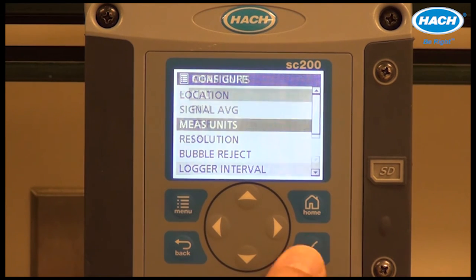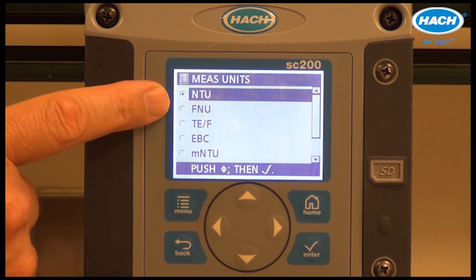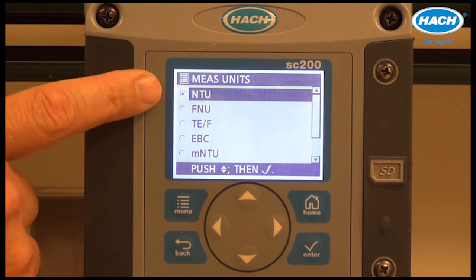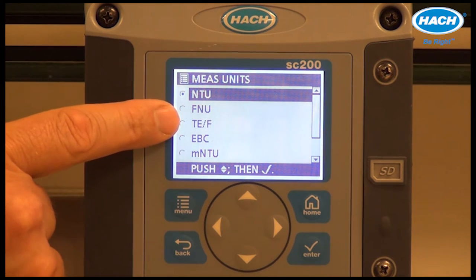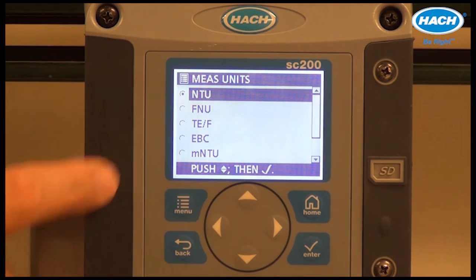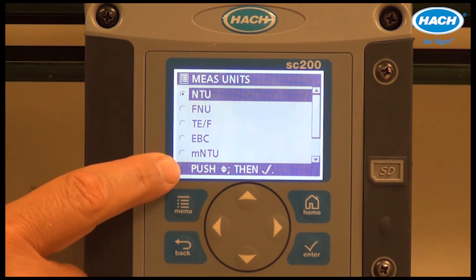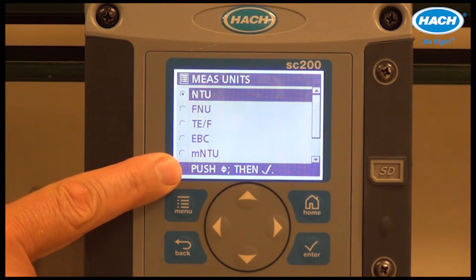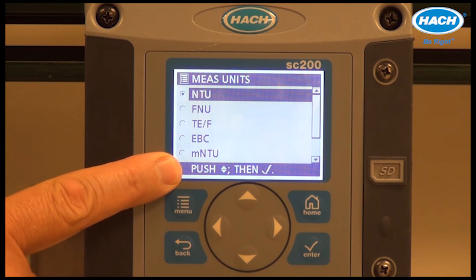Measuring units: while the default is NTU, or nephelometric turbidity units, a variety of other turbidity units — for example, Formazin nephelometric units — are available. You can also choose milli-NTU for ultra-low turbidity applications.